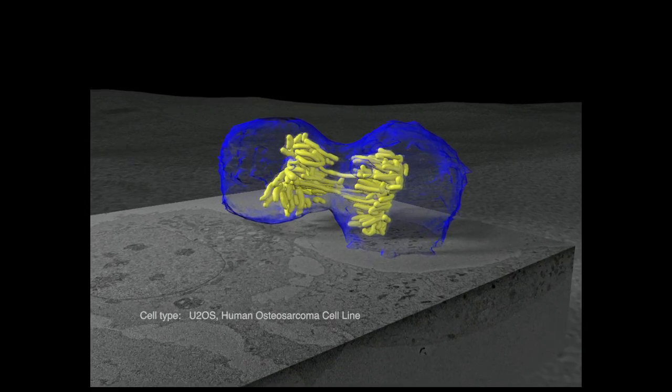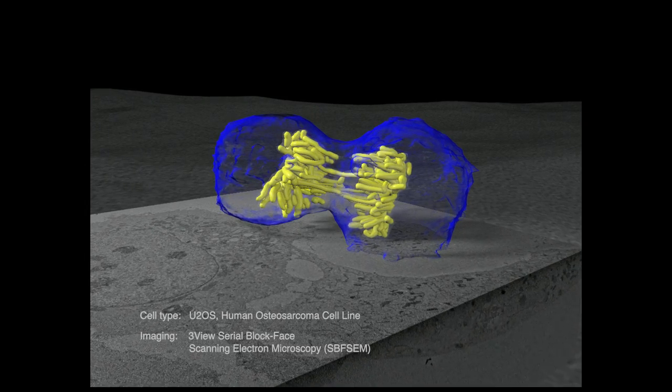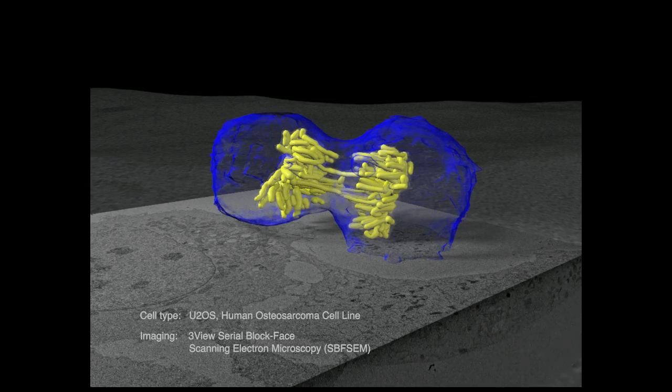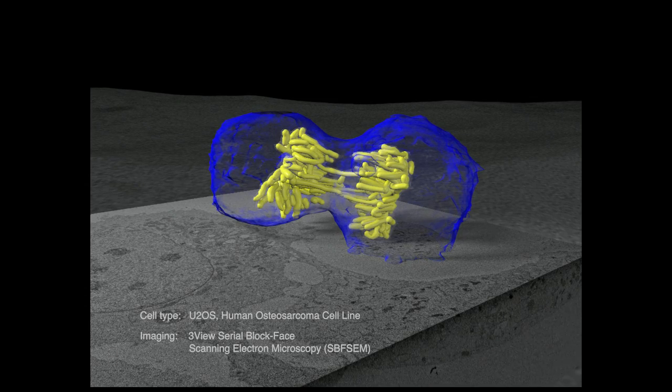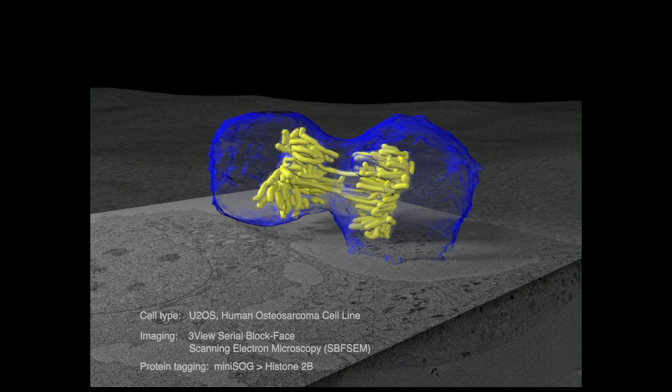The cell you are looking at is a cancerous human cell line imaged using serial block-face scanning electron microscopy with the GATAN 3View system to cut successive slices.